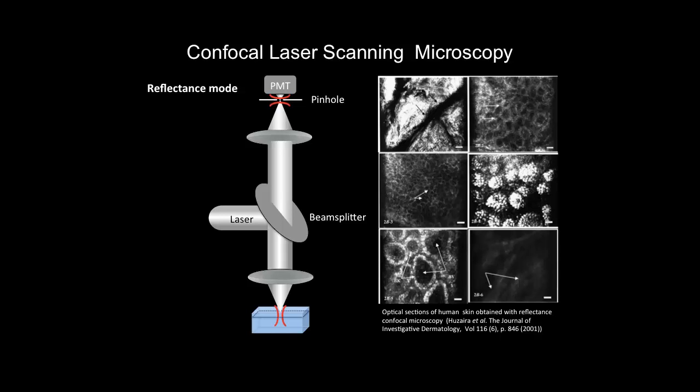Well, I think it matters that this is on a collimated beam. You keep the imaging condition as you translate the lens. But if it's easier to understand, you can think about it as moving the specimen.